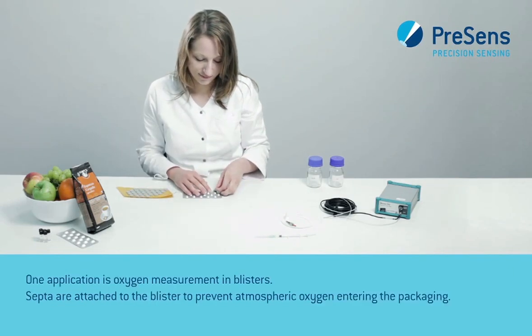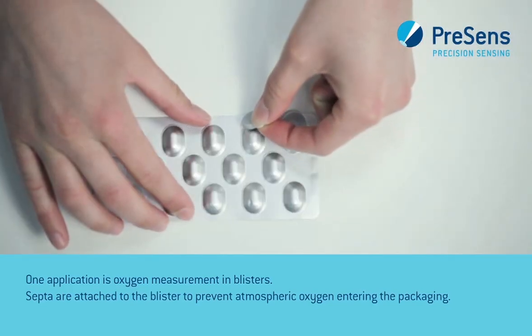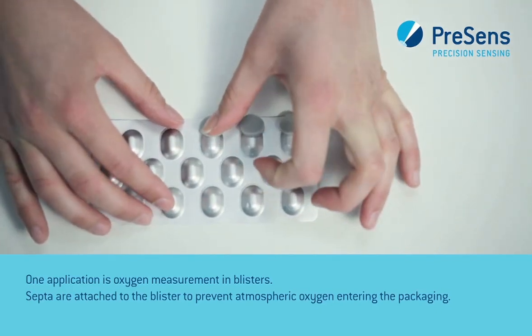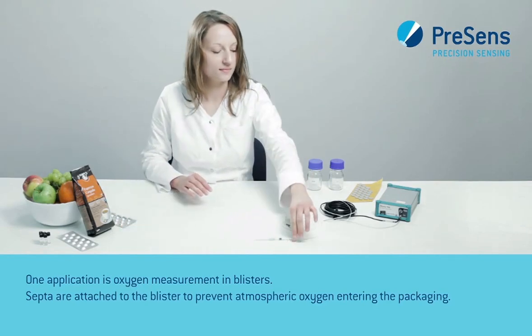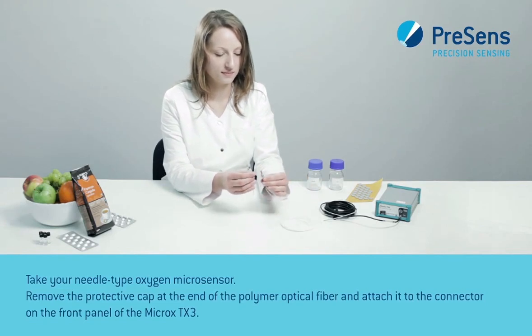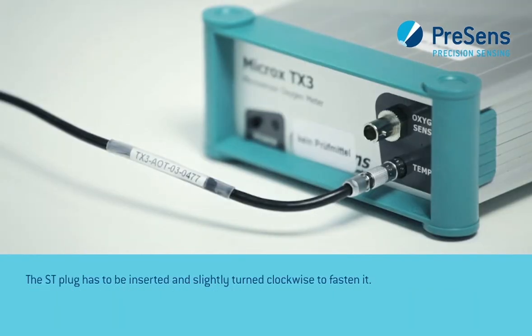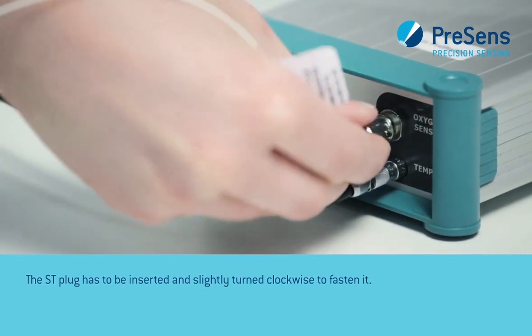One application is oxygen measurement in blisters. Septa are attached to the blister to prevent atmospheric oxygen from entering the packaging. Take your needle type oxygen microsensor, remove the protective cap at the end of the polymer optical fiber, and attach it to the connector on the front panel of the microx TX3. The ST plug has to be inserted and slightly turned clockwise to fasten it.